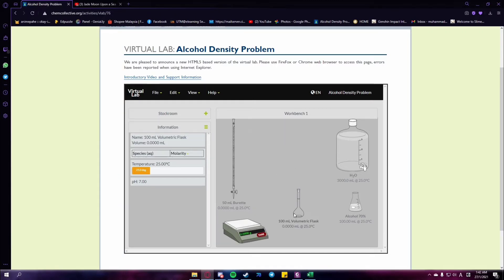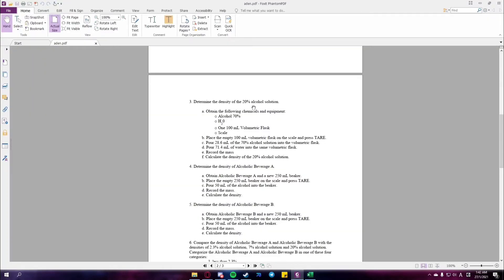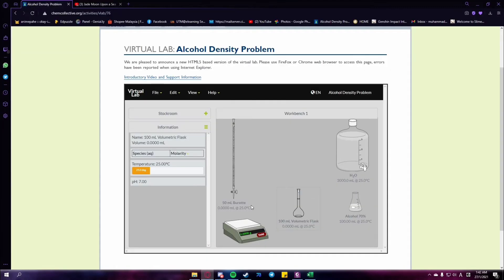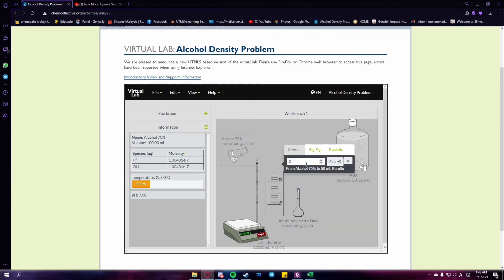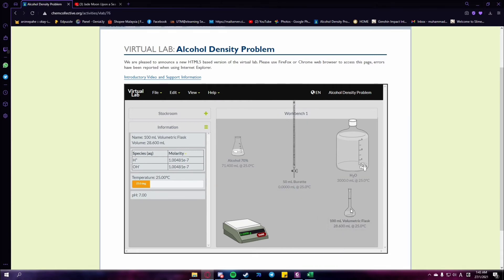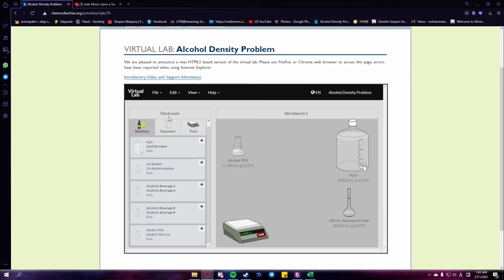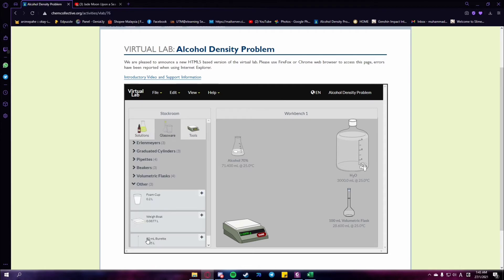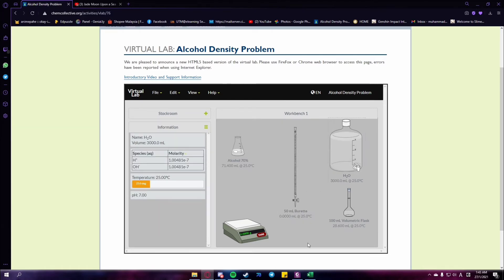After that, pour 28.6 ml of the 70% alcohol solution into the volumetric flask. Then pour 71.4 ml of water into the same volumetric flask. Next, record the mass of the solution and calculate the density of the 20% alcohol solution.